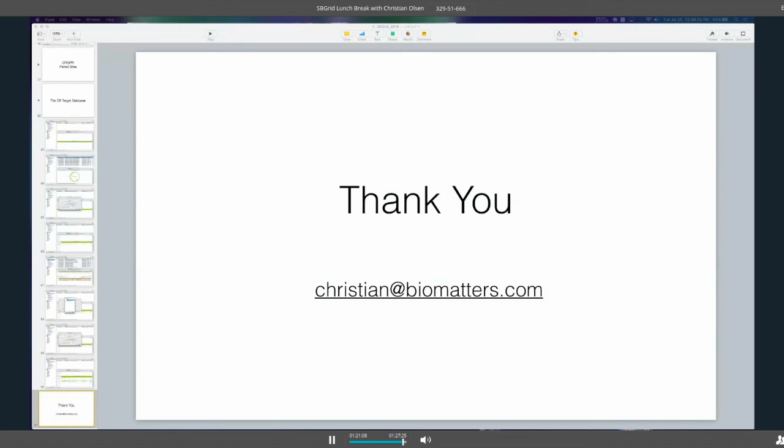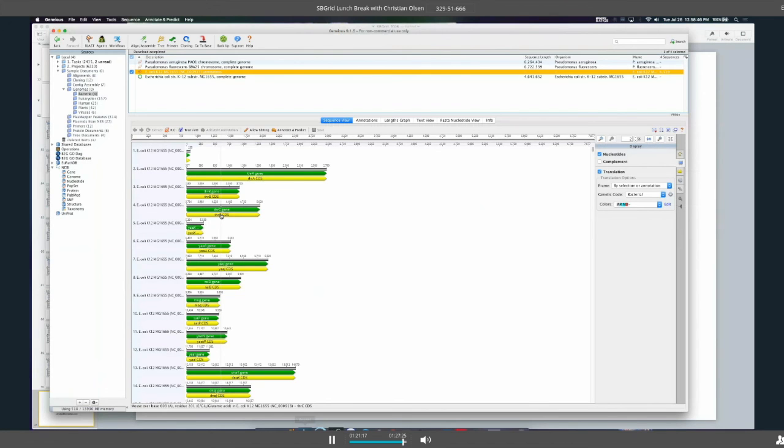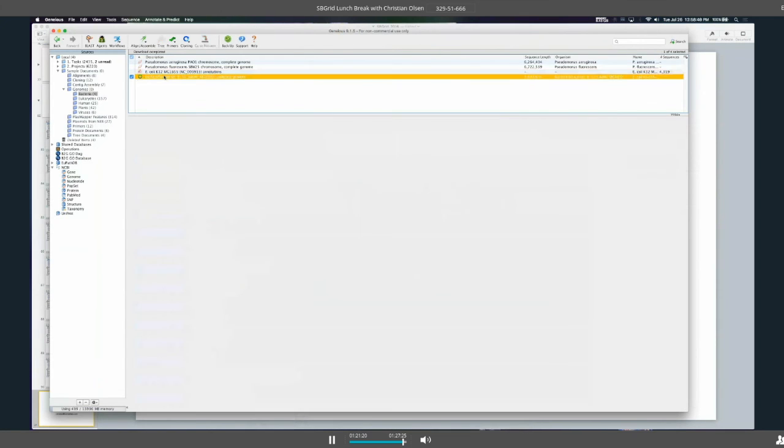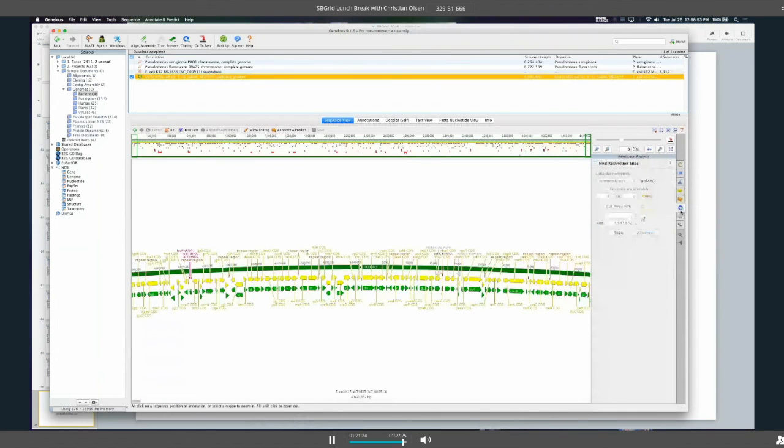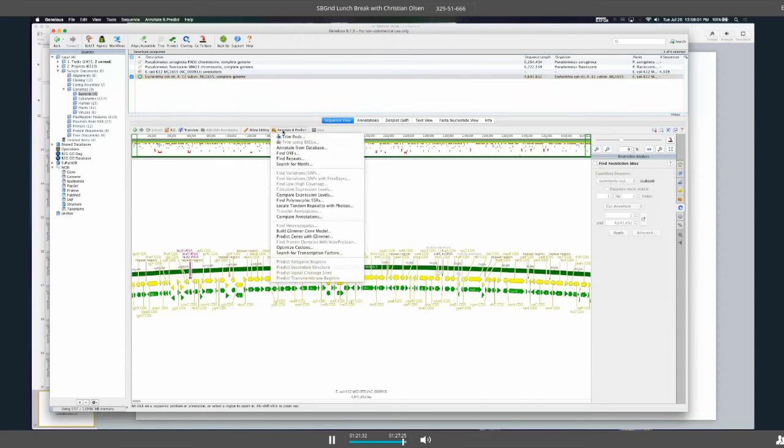We have a question from our local group here. Go ahead. Hello, sorry to ask you. I like the annotation automatic tool for finding restriction sites. Do you have some automatic tool, maybe a plugin or something, where when you have a DNA sequence, you can find in the translation some motifs like the TEV cleavage sites, protease cleavage sites, or like flags? Is there a plugin or tool that can automatically find and annotate these sites?